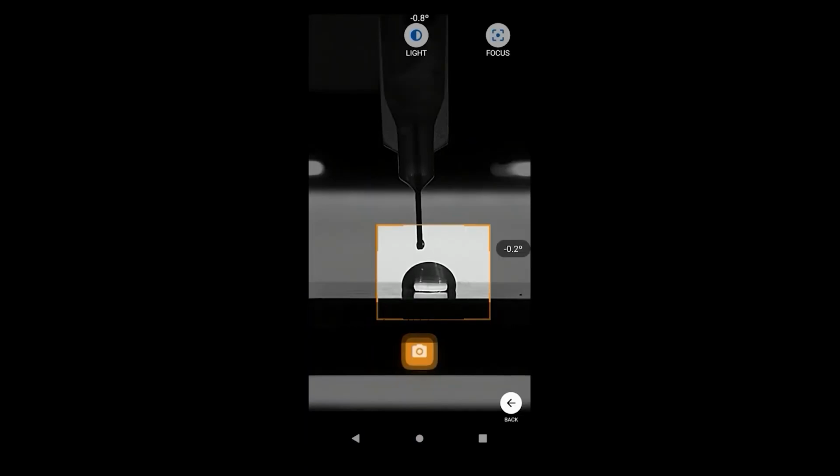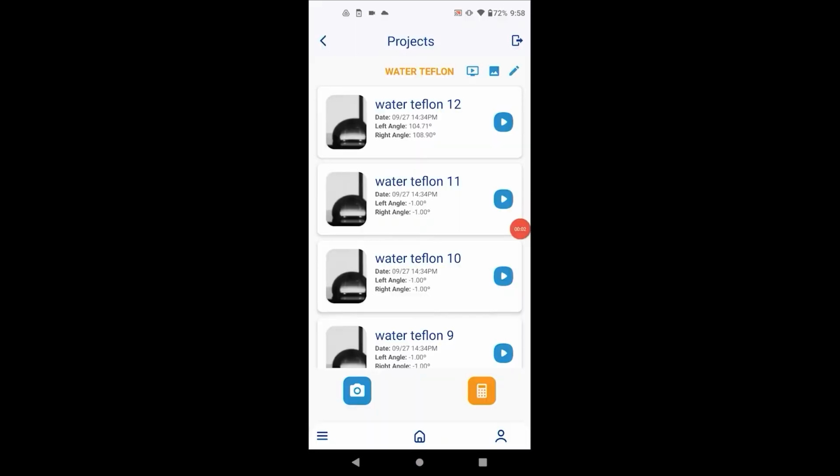Default is smart contact points. After completing a calculation in a series of images, the rest of the images can be automatically calculated from the project screen if all the settings were the same for each image.